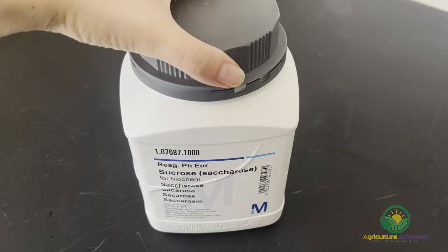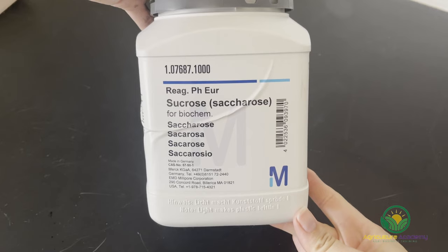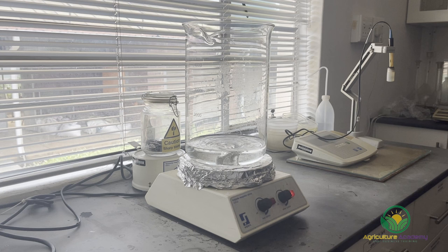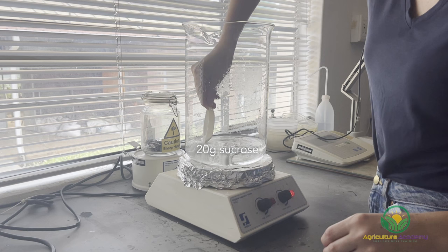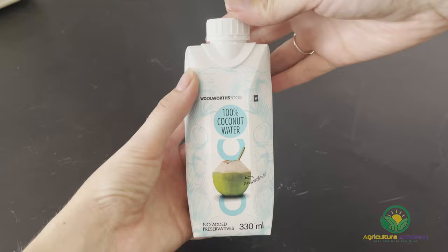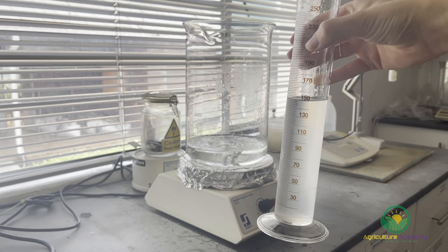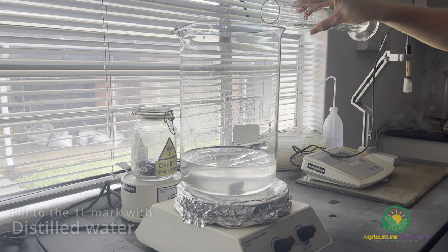Our recipe also needed to be made up of 2% sucrose and 15% coconut water. For 1 liter of medium, this translated to 20 grams of sucrose and 150 milliliters of coconut water. At home, substitute the sucrose for sugar. Both additions help supplement the endospermless orchid seed with carbohydrates. To finish the stock solution, the beaker was filled up to the 1 liter mark with distilled water.